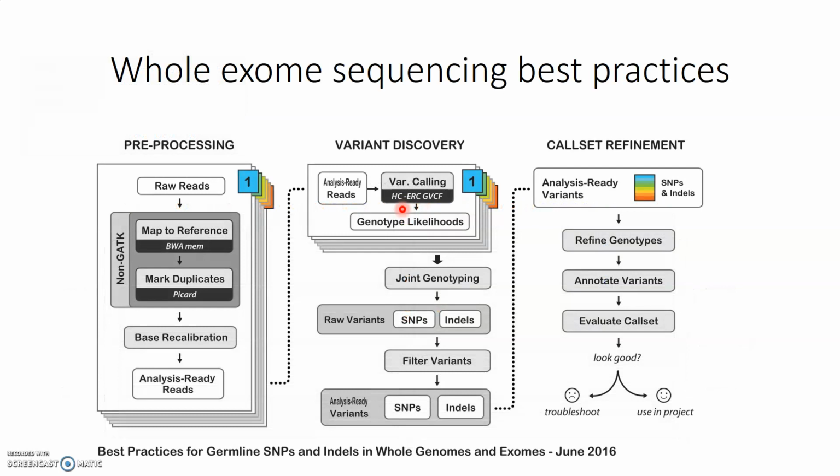We are now taking our raw reads in the form of our FASTQ file. This particular pipeline wants you to use a particular sequence mapping tool called BWA, which is also a very well used option. Again, we used Bowtie 2 to produce our BAM files. We then need to take our BAM files and actually perform variant discovery, or variant calling. There are several programs to do this as well. At the end of our variant calling, we get out what's called a VCF, or variant call file.